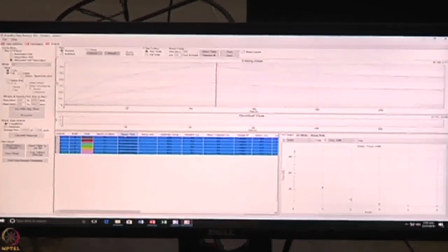So we have to choose the right one, if you know thoroughly, because when you are doing a publication, suppose I got a 1:1 fitting data that was not giving a good fit, but you went for the 2:1 fitting model, then you submitted a manuscript to some journal, then the reviewer will ask you one question: you have mentioned the 2:1 binding model, do you have any supporting data by any other technique that it is a 2:1 interaction? You have to provide that. Generally, reviewers ask this question for any paper. So that's why we always try to fit for a 1:1 interaction. Otherwise, if you have ITC data with a 2:1 stoichiometry, then that's good enough. Or otherwise, you have to establish that, or modify your protocol so that you get a 1:1 interaction.